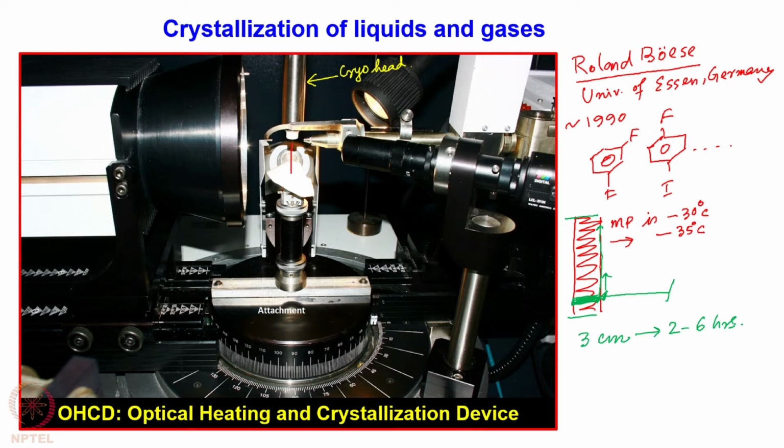What is a single crystal? We will get to see in the next few slides. So in this process, one can crystallize materials which are liquid at room temperature. One can form good single crystals out of it and then do the data collection on those crystals.